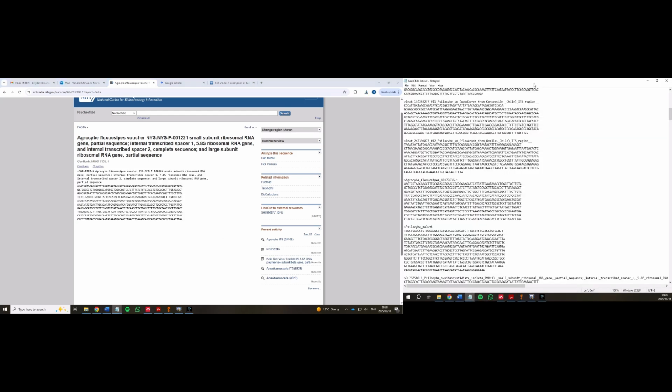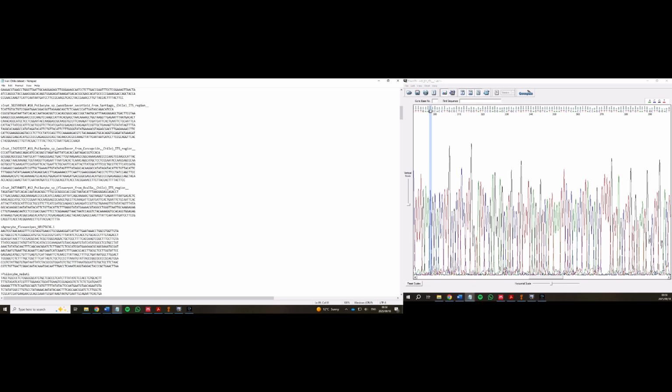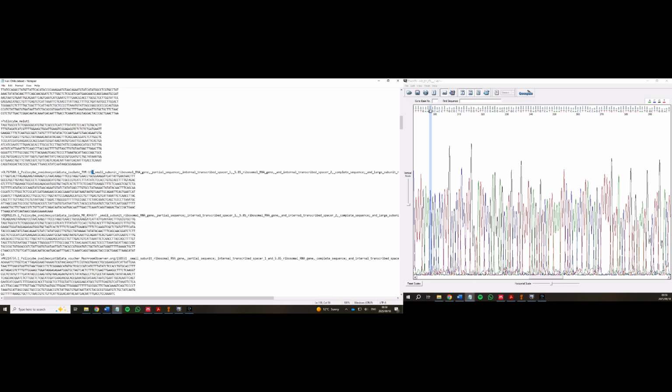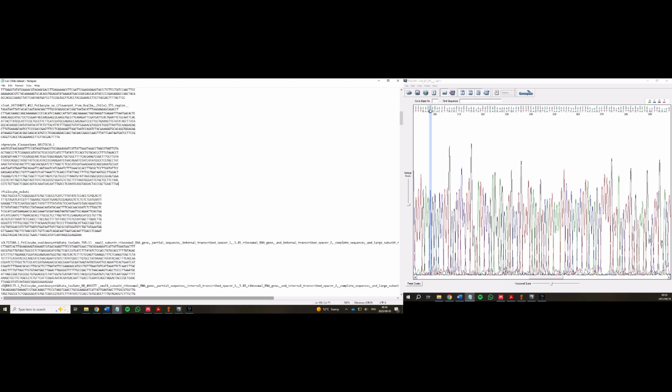And now you go to that big shared file you made of all the closest relatives, and you copy paste in your sequence as well as the outgroup's sequence. And this is now your reference database or data set that you use to build your phylogenetic trees. It's a good idea to replace spaces with underscores because most programs can't read spaces, and at the end of the sequence, when all informative sequences are done, you just put in a space and that'll remove all the rest of the nonsense.